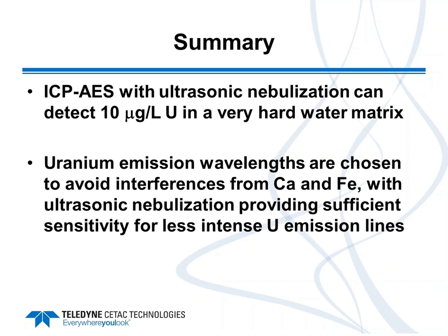In order to do that, you'd have to move to a sample preparation technique like chelation, in order to chelate the elements of interest and remove things that you don't want, like sodium, potassium, calcium, and magnesium.